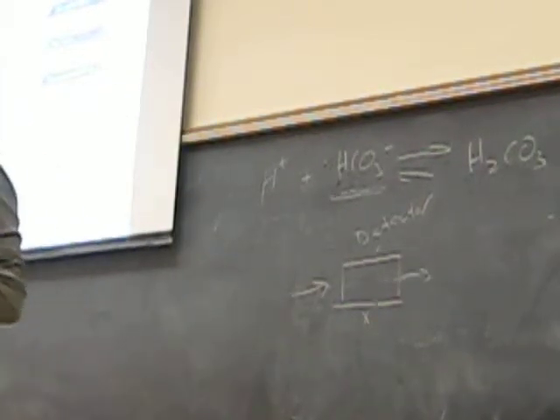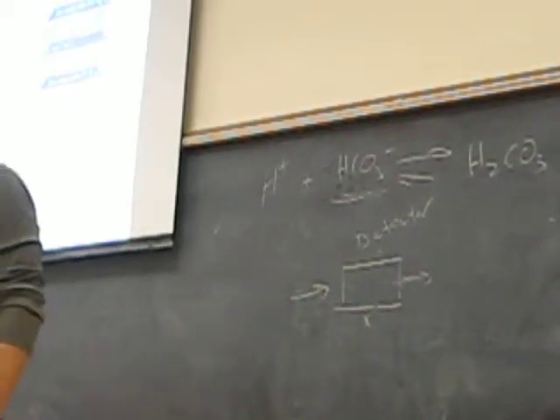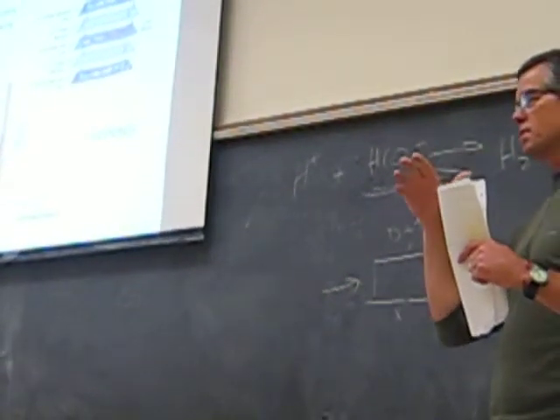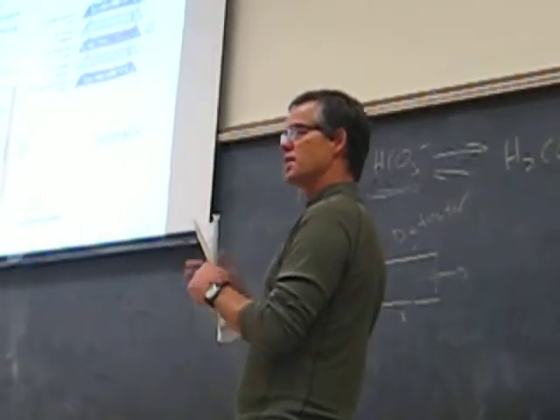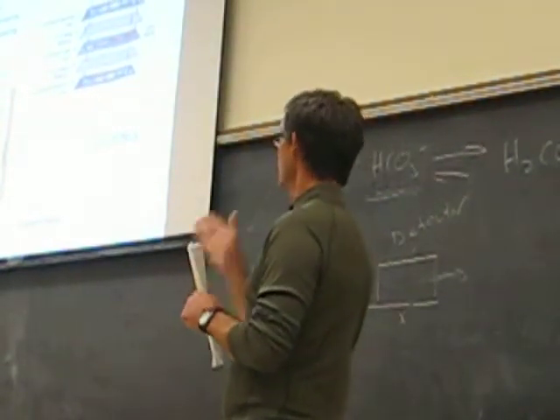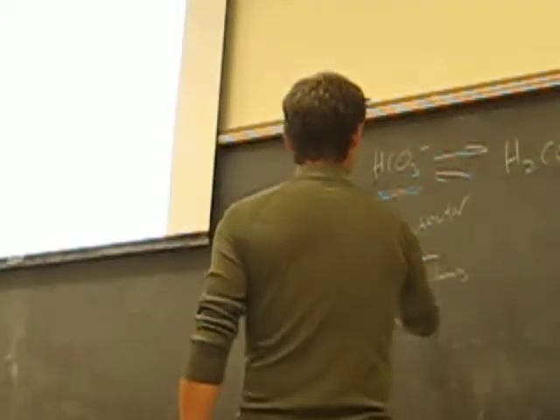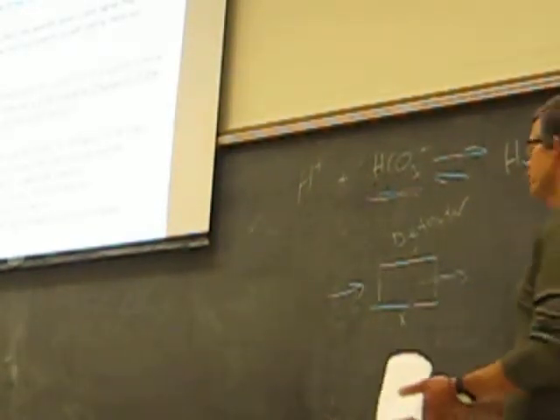You guys got that? Because we're going to ask you in your report to talk briefly about the suppressor and what role it plays. One thing for lab report number 2 and number 3 that you're going to expand upon from the first one is a much more developed discussion of the instrumentation, the theory of the instrumentation, and how the different components work that are essential for the function of that method. And the suppressor in this case for ion exchange. Okay, so the detector on this is, like we talked about, measuring conductance. Right?